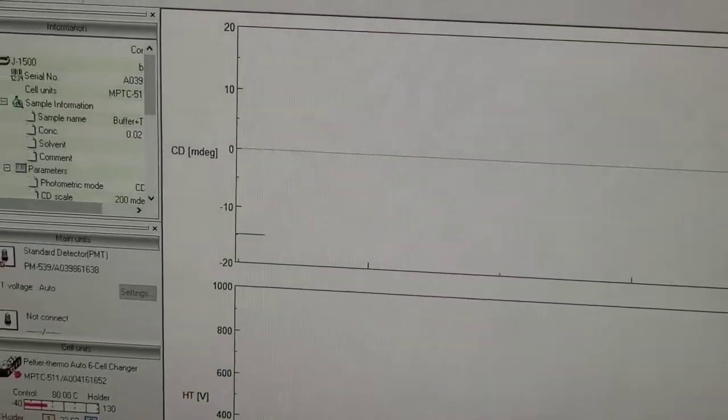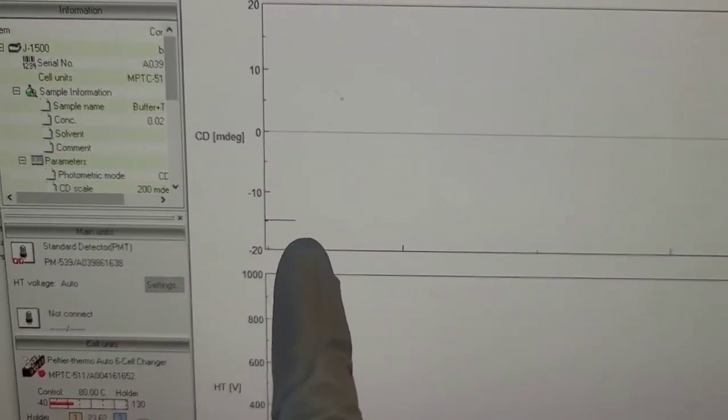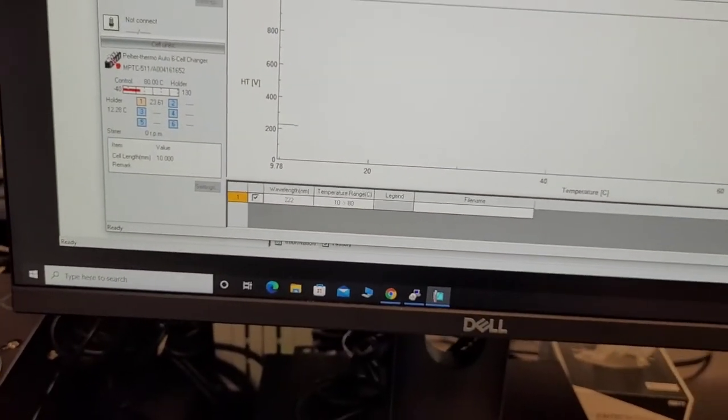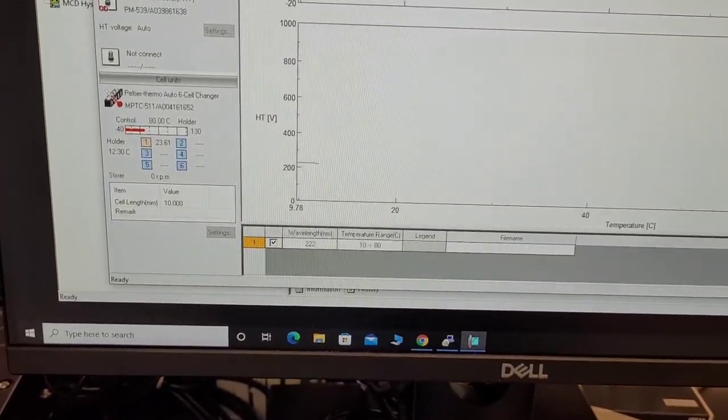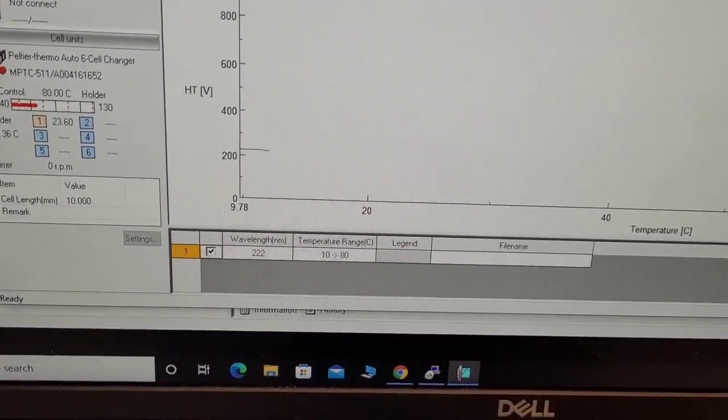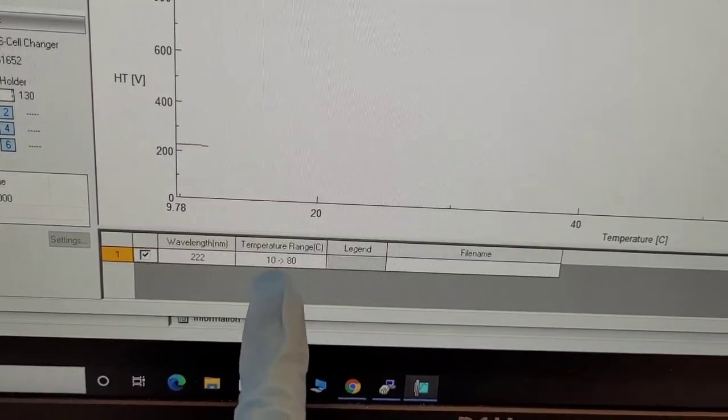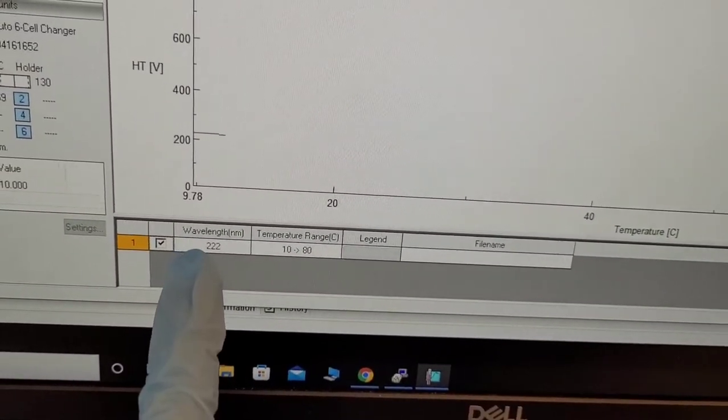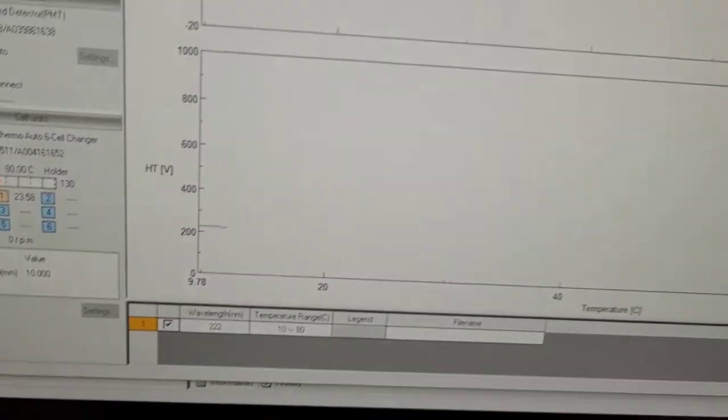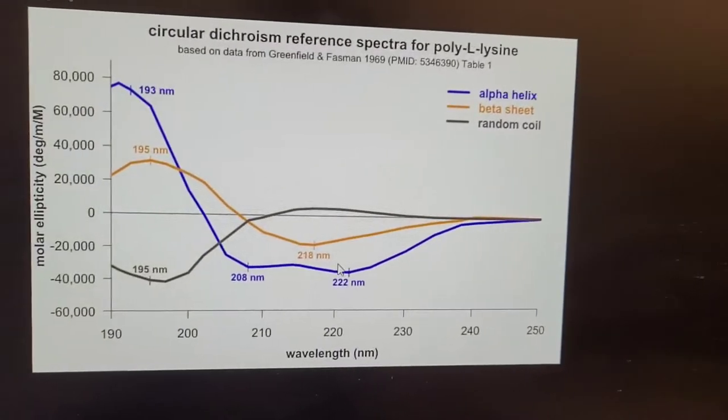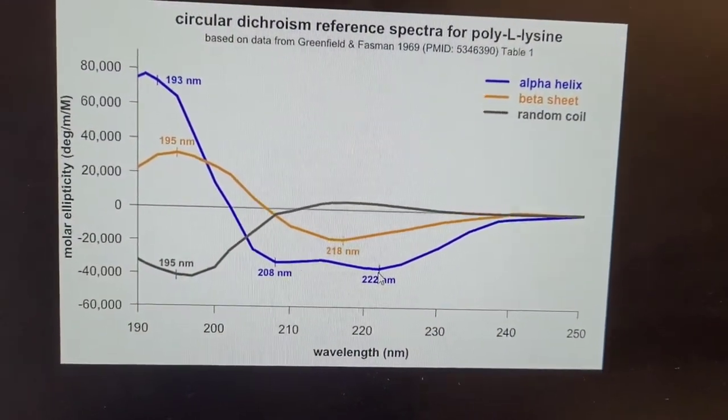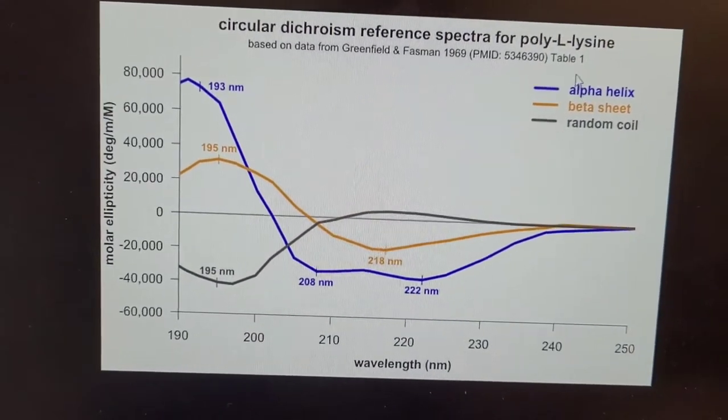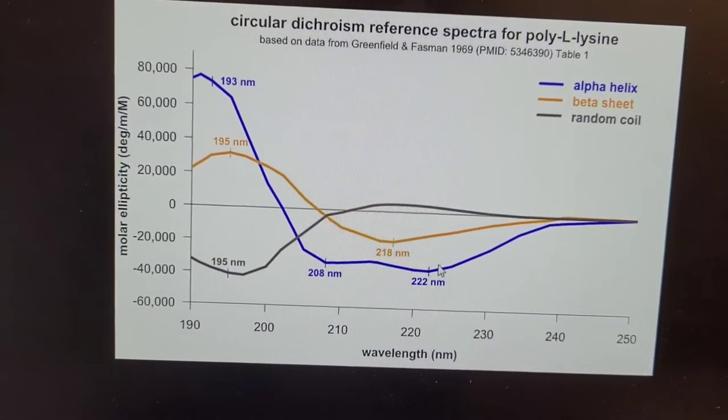So the experiment has begun, as you can see. Yeah, but it will take some time. So I will be back in an hour to show what I got. And as you can see, the temperature range is 10 to 80. The wavelength measured is 222 nanometer, which again is this minimum over here, which is a good sign of alpha helical, alpha helicity, as you would say.